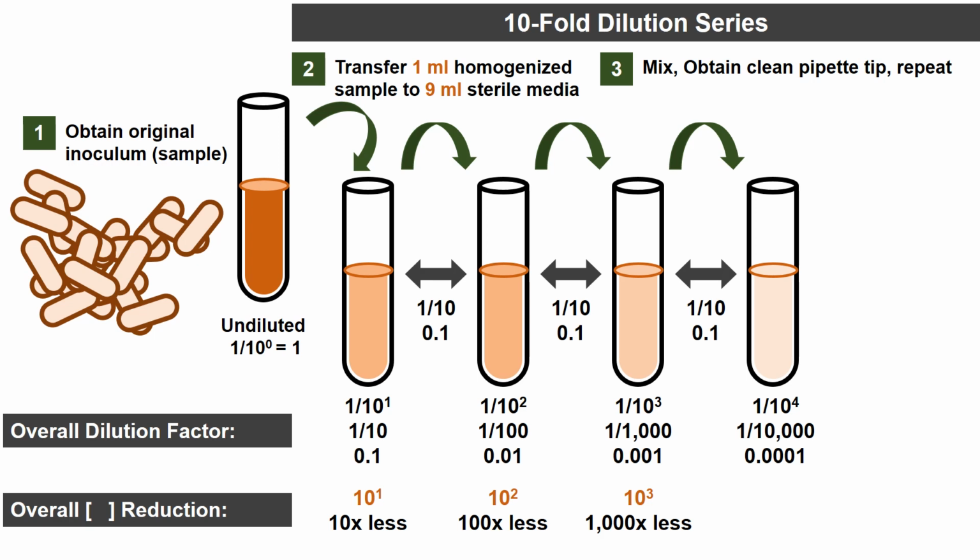And if we took 1 and we moved it 4 decimal places to the left, we get 0.0001. 3 zeros, 1. To the right of the decimal now. Okay? Relative to the overall concentration, it's important to keep this consistent. We now have a reduction of 10 to the fourth. This is the fourth tenfold dilution, or 10,000 times less.